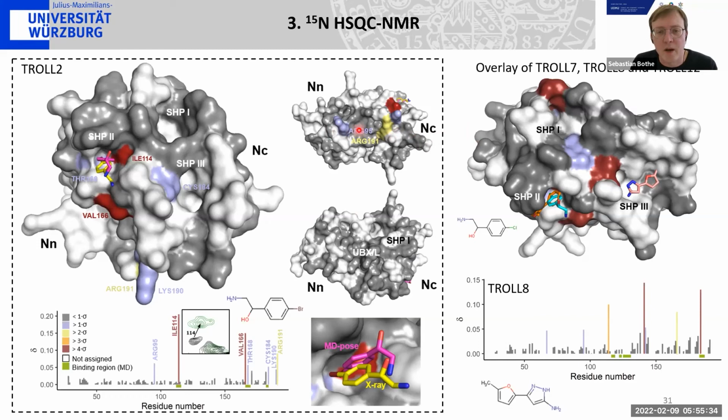There were some other chemical shifts, but these may only be artifacts of the construct, because we used only the N domain of P97, where we got the assignment, because the ND1 construct would be too big. And these areas are normally masked by the D1 domain, so that only this region of the SHP binding site is left in the biologically relevant system.